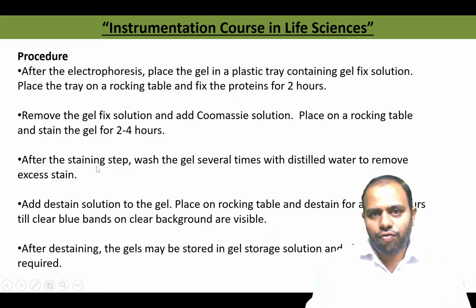After 2, 3 or 4 hours, it depends on the concentration of Coomassie brilliant blue also. If it is very dilute, then you have to keep the gel overnight, and if it is very concentrated, you can keep it for 2 to 4 hours. Remember, when you keep it for 2 to 4 hours, the protein bands will be stained along with the whole gel. So you have to go for a de-staining step, where you use methanol and glacial acetic acid solution to de-stain the gel. Excess Coomassie brilliant blue stain is removed, and you can see only the clear protein bands.